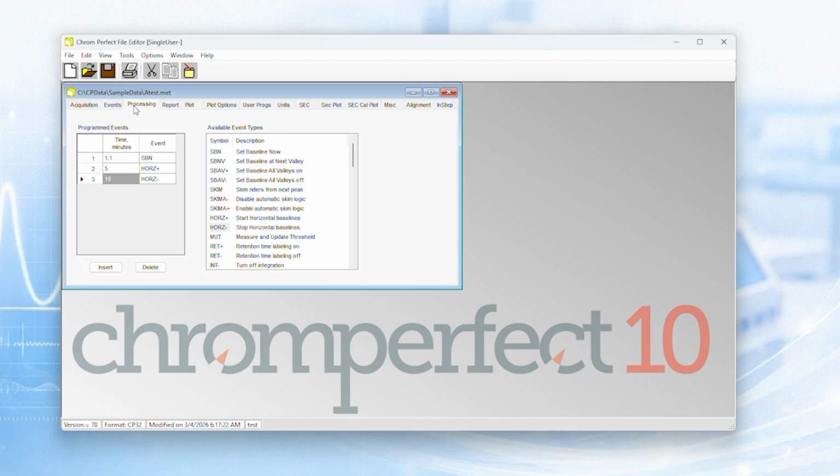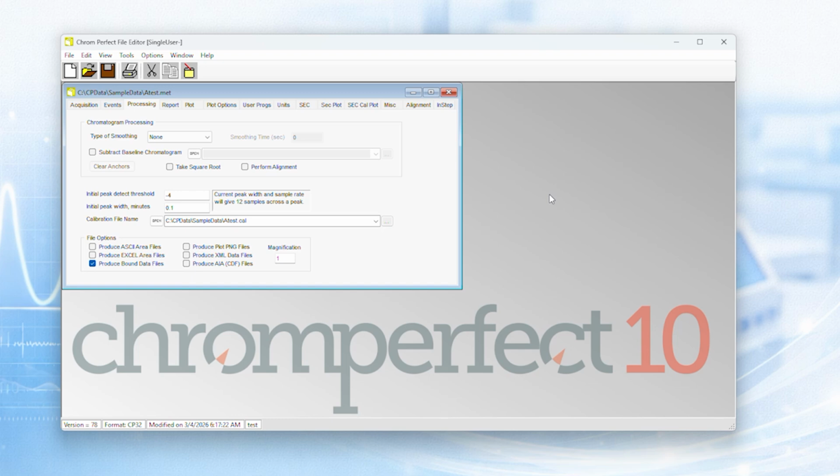Next is the Processing tab. The Processing tab is one of the most important tabs in the method file. This is where integration parameters are defined. Settings such as threshold, peak width, and other integration controls determine how peaks are detected, integrated, and quantified. These settings affect how Chromperfect interprets the signal contained in the data file. They can significantly influence calculated areas and quantitative results.